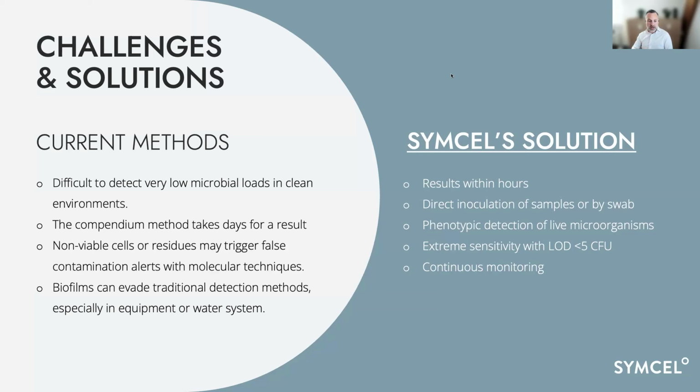We have also discussed quite a lot that if you're going for more molecular techniques, there's potential of getting false positives, because if you have residual DNA in the environment, that can trigger a false positive, which can also be highly expensive in these environments. You might have to put down a whole litter of mice or animals just because you have a false positive.